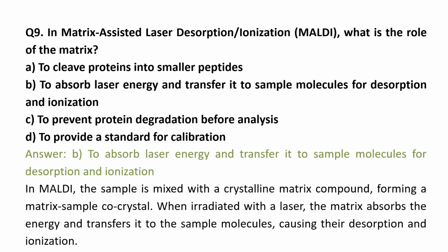So the answer is to absorb laser energy and transfer it to sample molecules for desorption and ionization. In MALDI, the sample is mixed with a crystalline matrix compound forming a matrix sample co-crystal. When irradiated with the laser, the matrix absorbs the energy and transfers it to the sample molecules, causing their desorption and ionization.